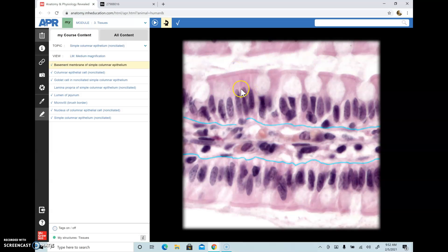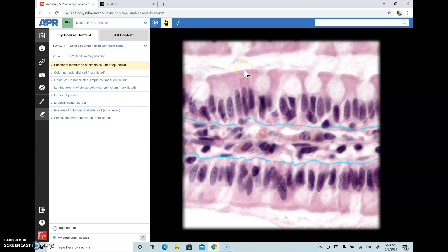The structure we're looking at is non-ciliated simple columnar epithelium. You find microvilli in the digestive tract and also in the reproductive organs. Non-ciliated structures are also found in the eyes, the ears, and the buccal cavity — that is the oral cavity. But you find brush border in regions where you need a lot of absorption, that is in the digestive tract.